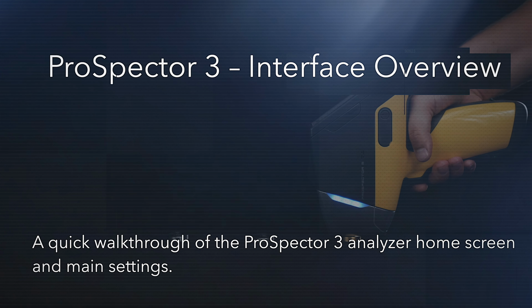Also here we have the hardware configuration. Here you see the serial number of your analyzer and the detector which is installed into the analyzer. The next one is software version. Here you have just the version of your software. And the next one is current user. Here you see the operator that is currently using the analyzer, because you can add more than one user, and after that in your reports you can see which user made some particular measurements.